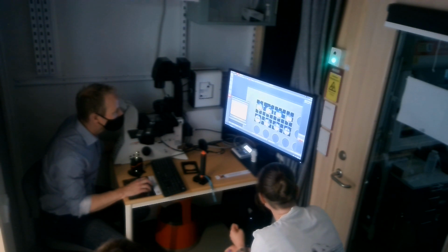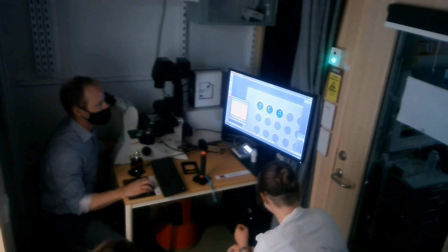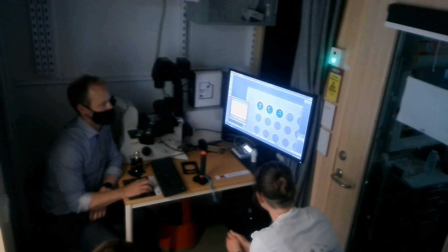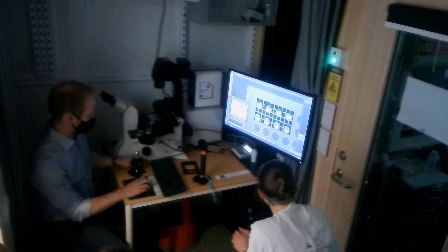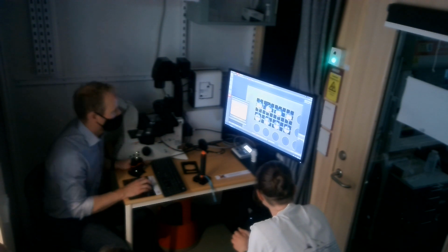Now does it use your areas? So does it use your annotations, what you made based on the picture, or no? No, that's exactly what it didn't do. It's using this thing. So what I was hoping to do was to basically select all of them and move all of them at the same time. But I thought I would be able to do it, but I cannot. Okay, never mind then.